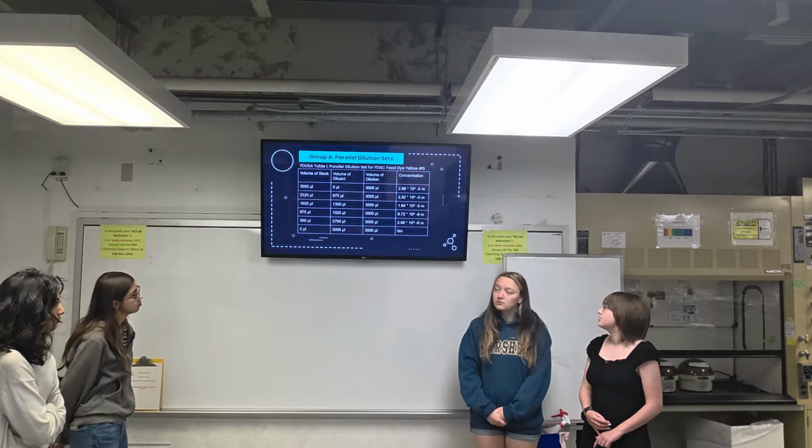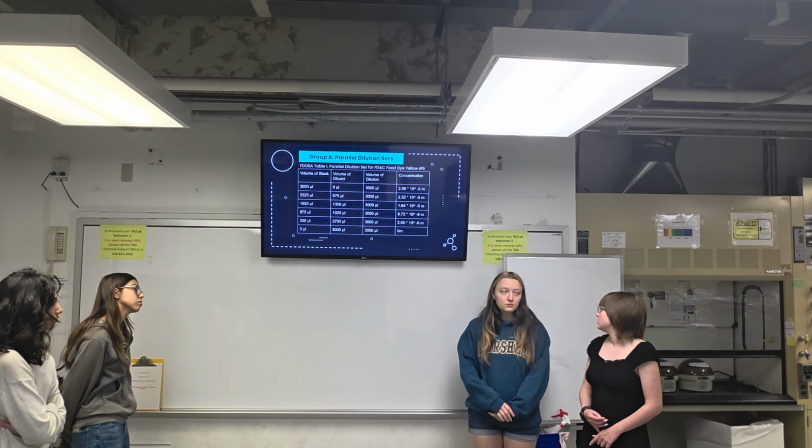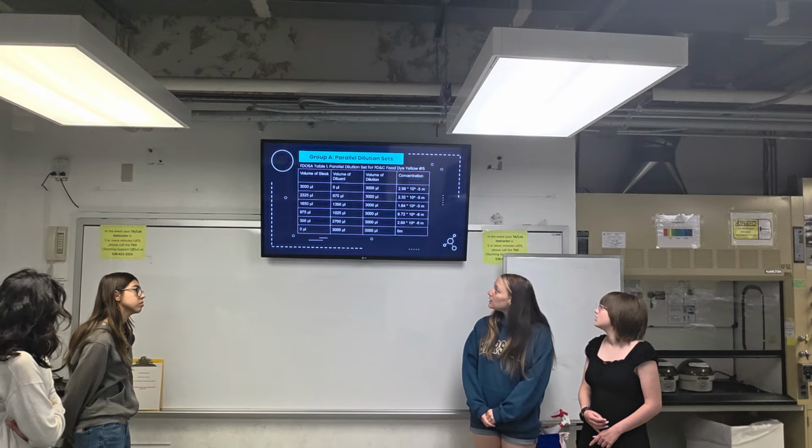So we just had the volume of stock, the volume of diluent, and the volume of dilution, and we basically just did them equally to get the concentration. What's on our next slide? Do you want to switch it?